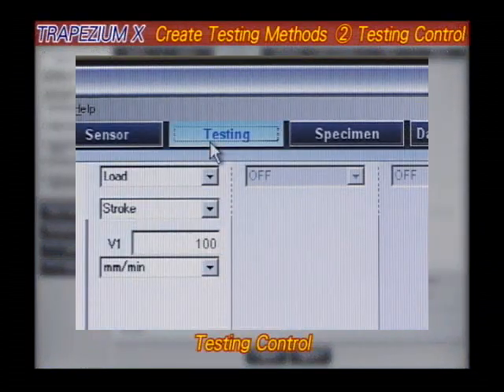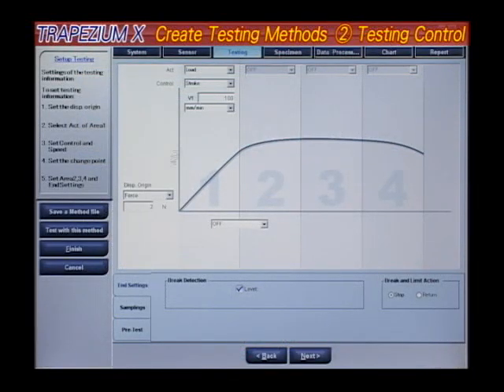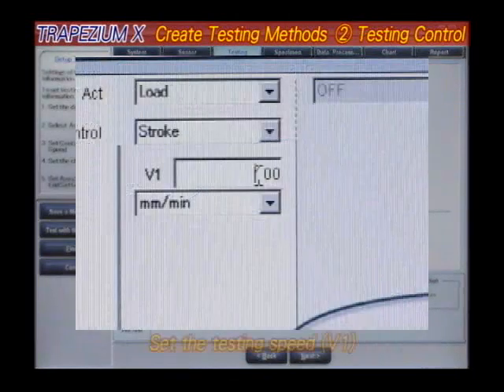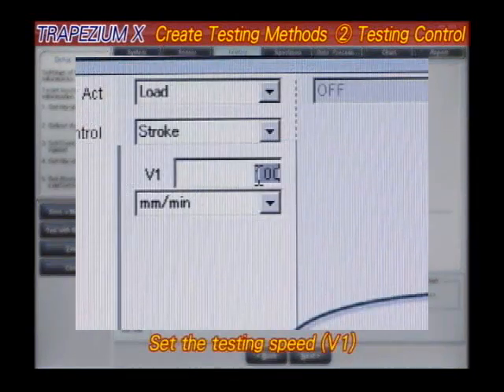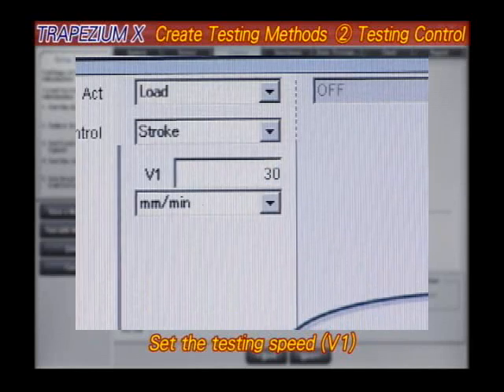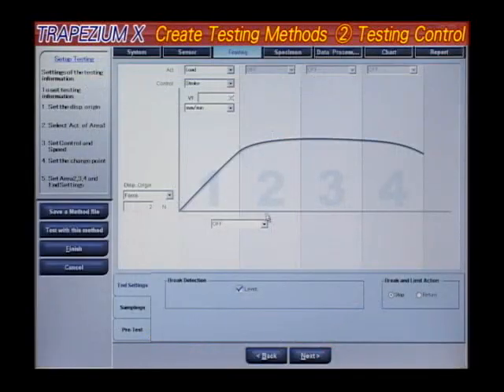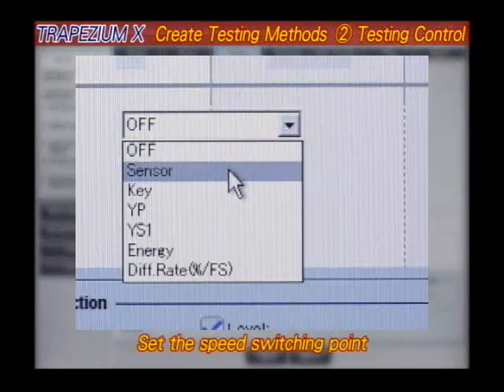Testing control. This window is used when testing includes multiple testing speeds. This window also allows the changing of sampling parameters in mid-test.